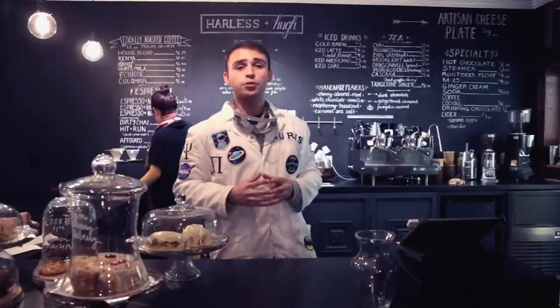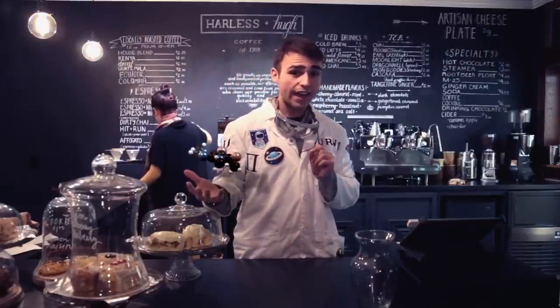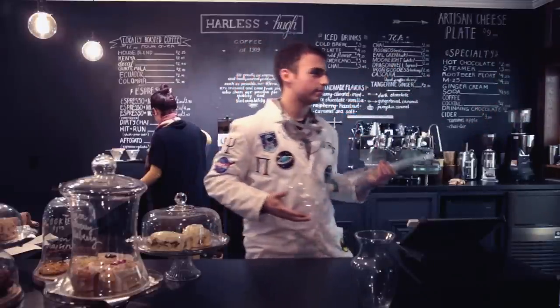Today, we're going to extract crystals of caffeine from coffee. But to do that, we have to first brew the coffee the chemistry way. Let's go to the lab.